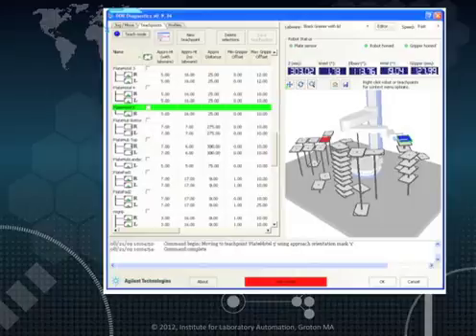While earlier robotic systems relied on physically locating objects and reference points, more modern systems allow for both physical and numerical adjustments to locations and movements. This approach allows for better modeling of systems operations, testing, and updates as required. It also allows a robot to be put to use while changes are being considered, instead of taking the system offline. The actual robot programming can be updated once adjustments are completed.